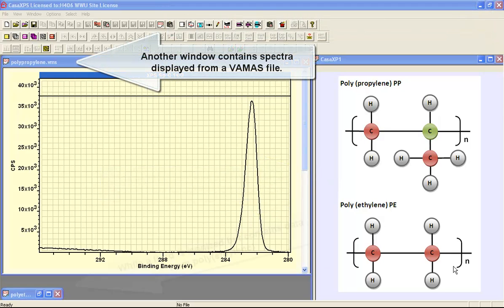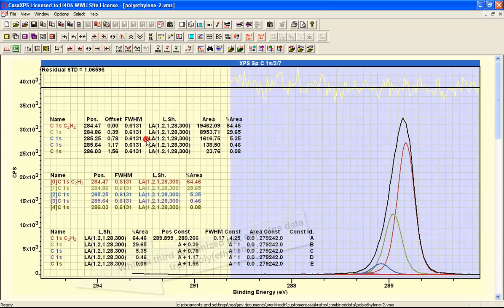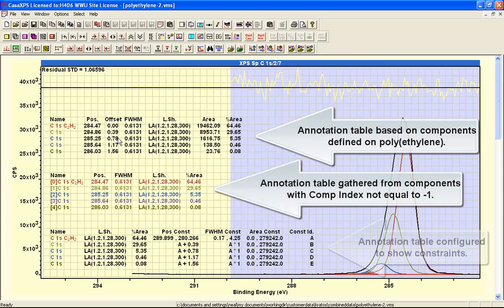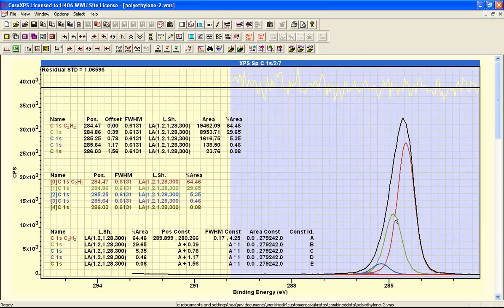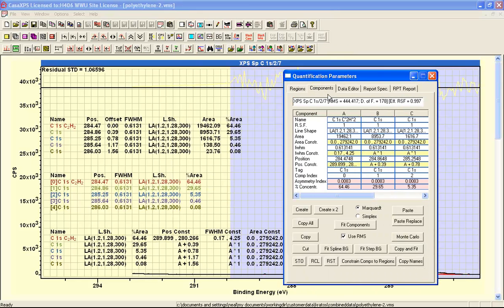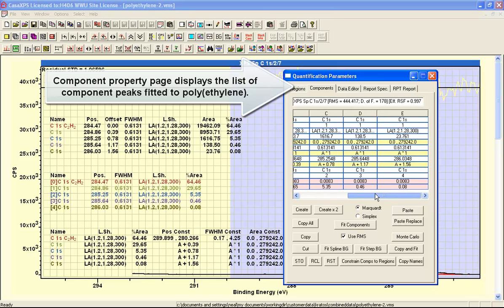In an earlier video, a peak model for polyethylene was constructed that involved a sequence of peaks calculated by defining a constant offset representing the vibrational states, and then fixing the full width half maximum, as you can see here in terms of the constraints, and then allowing the peak areas to adjust to accommodate the data. So at this point we have a peak model with a set of peaks that are modeling the asymmetry for polyethylene, and they're defined in terms of 5 different components.